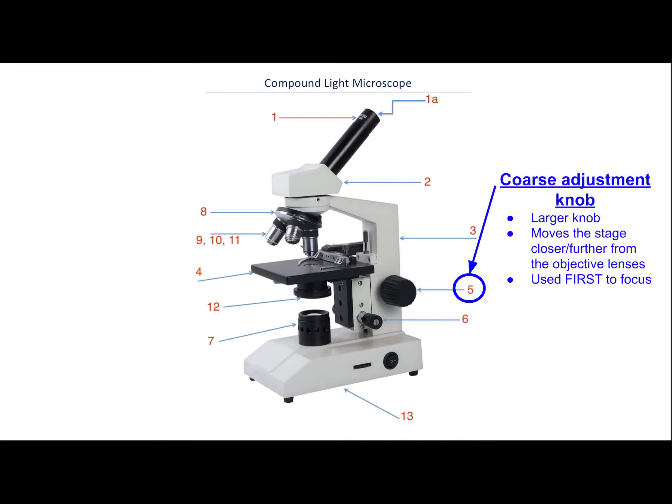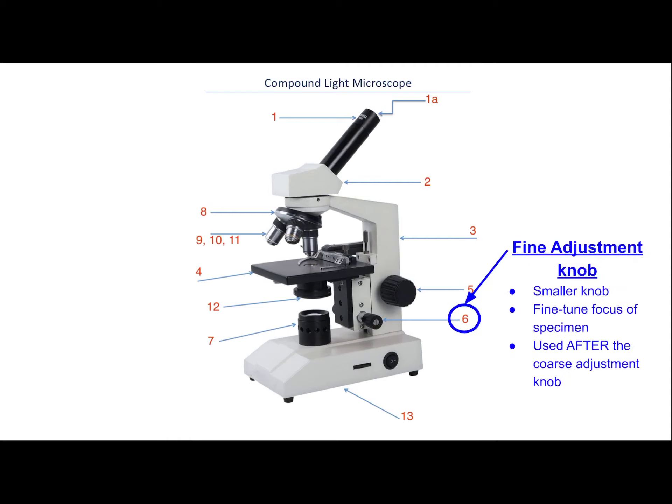Number five: the adjustment knobs. The bigger knob is called the coarse adjustment knob. When you turn this, the stage will move up and down — moving the slide closer to or further from the lenses. You will always use this first, as it moves the image fairly quickly. Use it to get your initial focus. After that, if you need a tiny adjustment, use the smaller knob — the fine adjustment knob — to fine-tune the focus of your specimen.